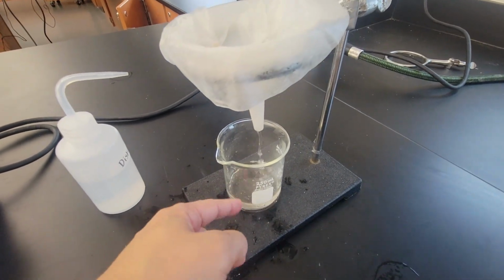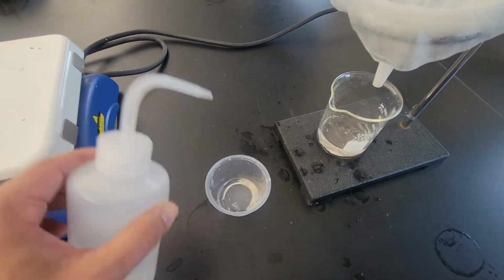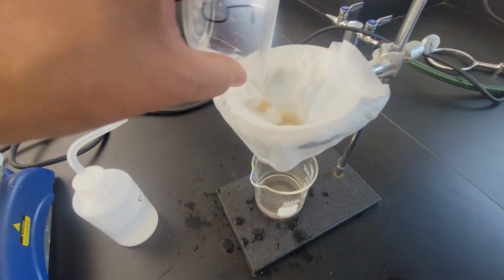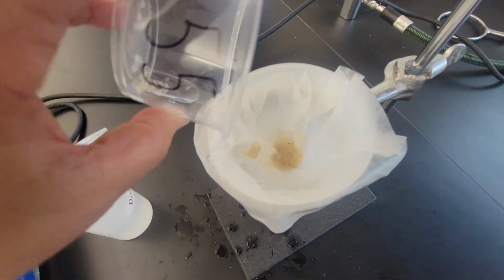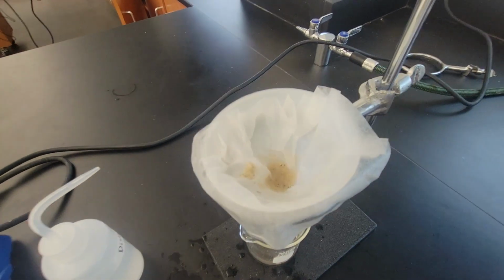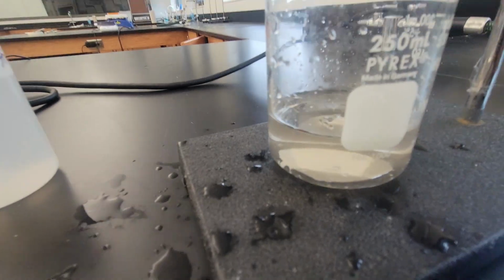And I have a beaker here collecting the liquid portion. I'm going to use a wash bottle, give it a few more rinses. All right, and I've gotten pretty much everything out of there. It's all either there, the solid sand, or down here, which is the liquid salt water.